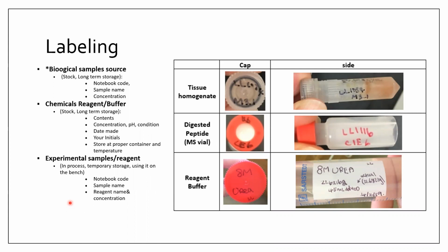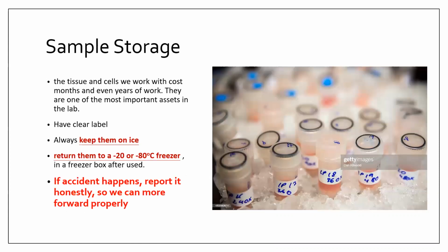What happened is there was an ammonium bicarbonate bottle in the bench area, and I just confused myself. I did not read the label well, which you should read, top and side, 3 times before you use your reagent. And what I learned is that if you only have one active reagent in front of you, it is unlikely you'll mess up. Okay, so that's what's important about labels and reading labels. Next slide, we're going to talk about sample storage.